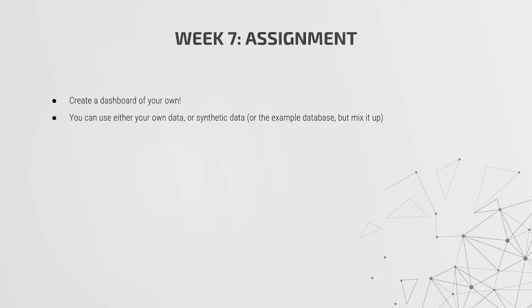Would more secondary standard results make sense to you? Would that be useful to see if they're drifting off in one direction, like you're getting further from the truth? Obviously, in that example that I showed, there were things that should have been added, like it should have had some labels, but I could have also added the accepted value as well to see if we're consistently offset from the accepted value.